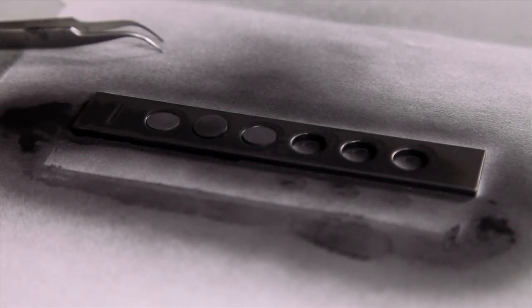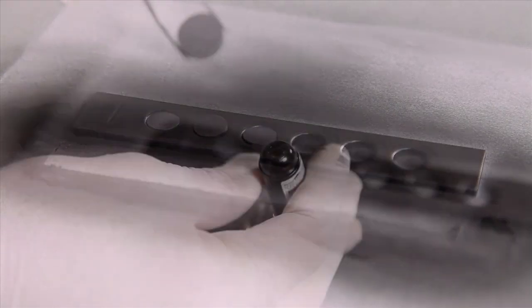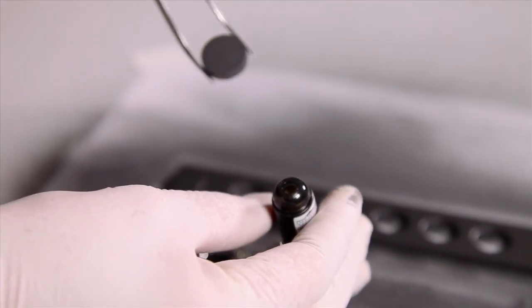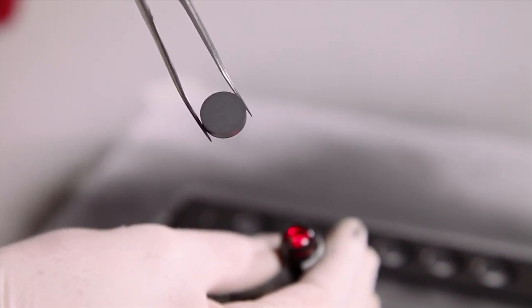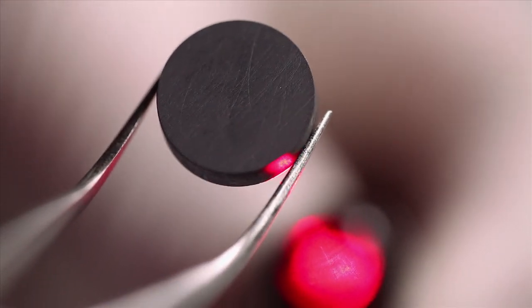After the samples are dry, you can check with a laser pointer to make sure if your sample is opaque enough. If you cannot see any of the beam on the other side, it means that our sample is opaque enough and we can start a test.